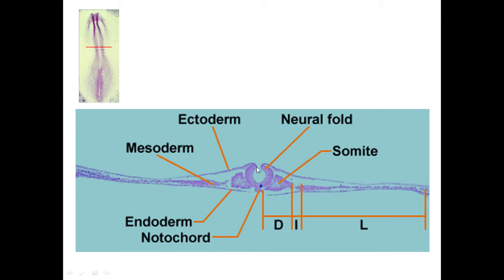So as I was saying, you can see that the neural tube is partly closed on this part of the animal. So remember that the initial closure, the closure of the neural tube, starts from the middle portion of the head process. So it travels both cephalic and caudal. So you don't expect that the neural tube area in these regions is going to be as closed as those that are seen on this cut.